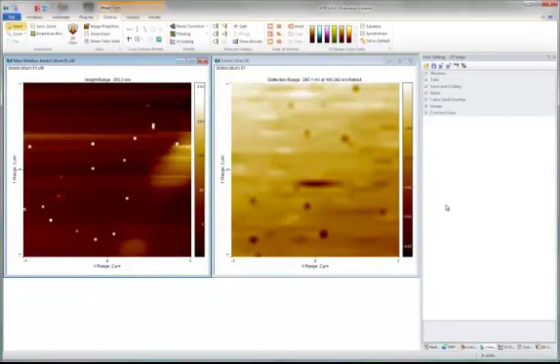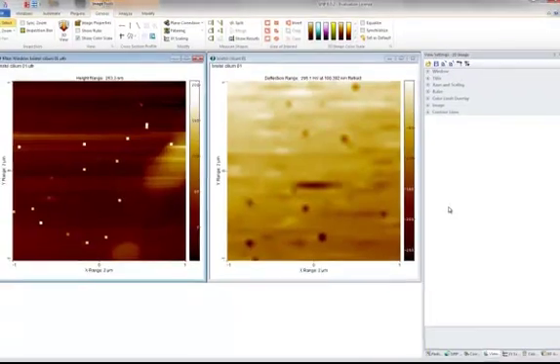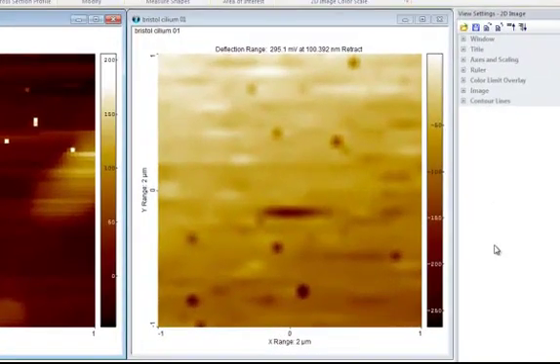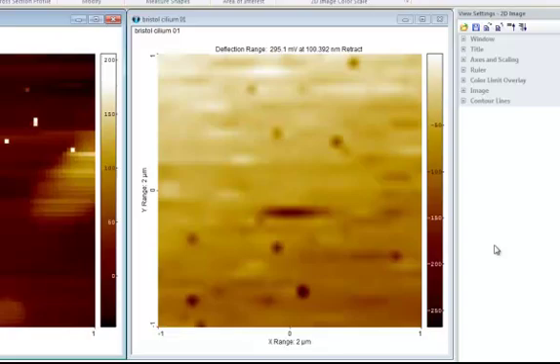This tutorial will introduce you to force volume analysis in SPIP. A force volume image consists of an equidistant grid of force curves. In this case, the force volume curves represent deflection versus height.